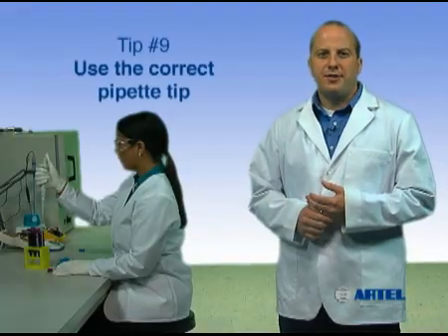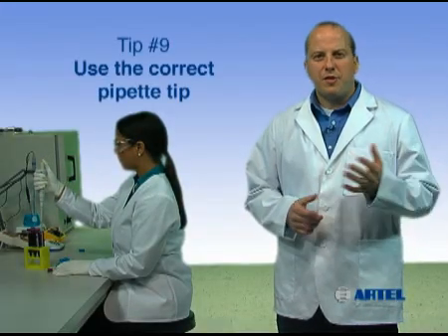Pipetting tip number nine: use the correct pipet tip. For the pipet being used, it's very important to choose the correct tip.